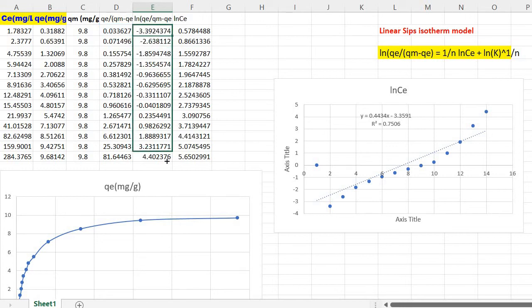And so this is your ln QE divided by QM minus QE value. Again, we need to convert CE into ln CE. So just write equal to ln A2, then enter and scroll down this. This is your X axis and this is your Y axis value.